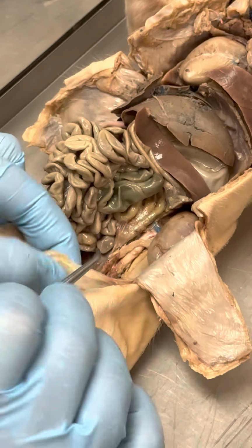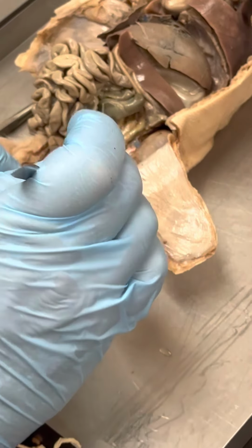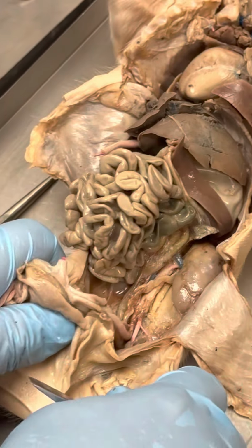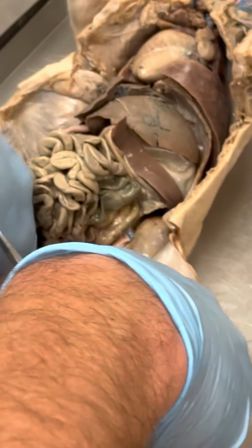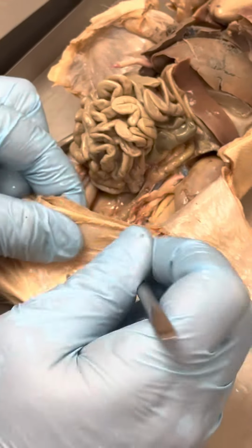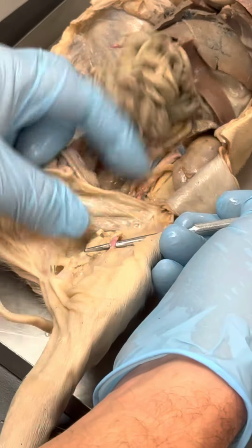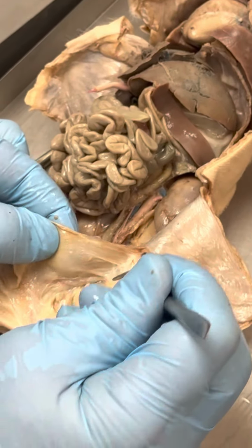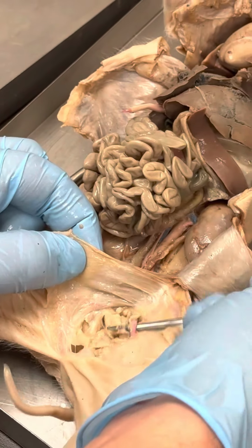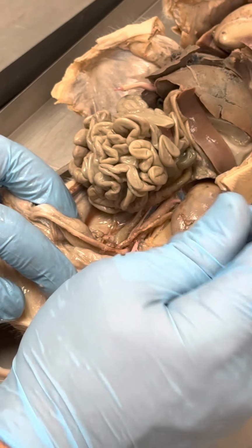And then once it pokes through your abdominal wall right here, this is a nice one. So it's iliac here, and then once it pokes through, that makes some noise. Somebody hum. There we go. Once it pokes through here, it will then become your femoral. So look for this. And I'm not going to be a wise guy and put it right in the margin of them and be like, oh, where's it end? No, I'll be obvious. I'll put it way down here or way up here. Iliac and then femoral.